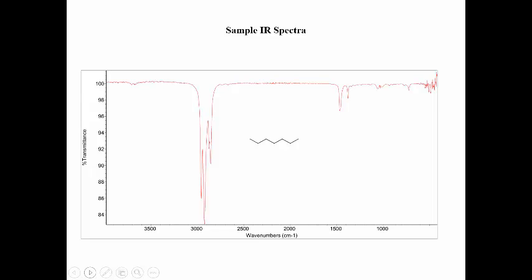In Chapter 13, Part 2, I'm going to show you some sample IR spectra for different functional groups so you know what to look for when you encounter your first IR spectrum in lab next quarter.